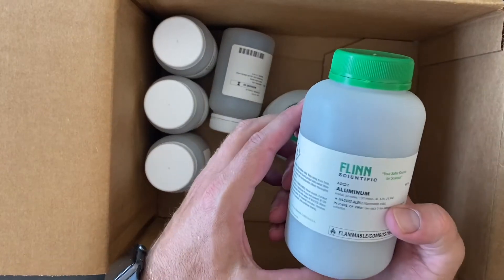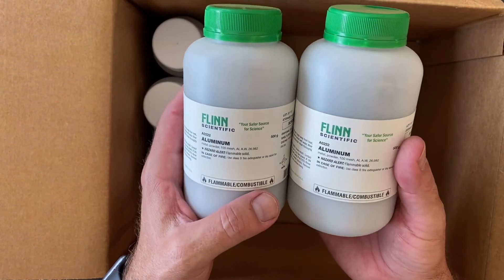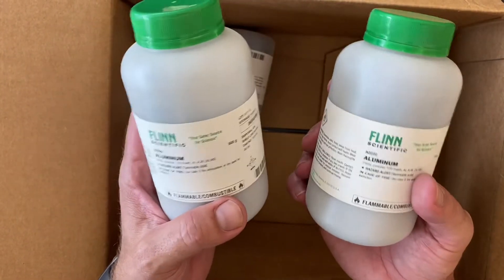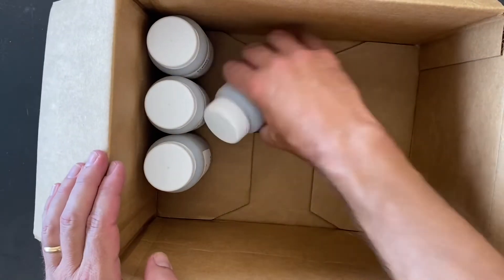We also have some powdered aluminum, which is the other component you need to make thermite. We did a lot of that last year so we're going to have to replenish our stocks for this year.